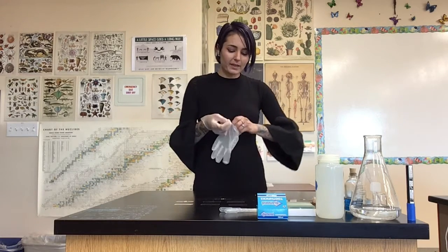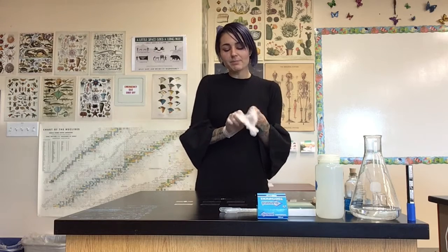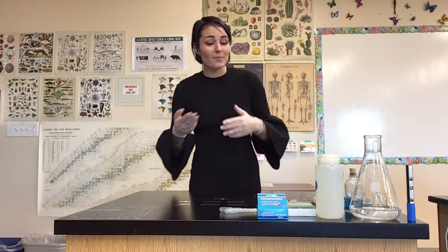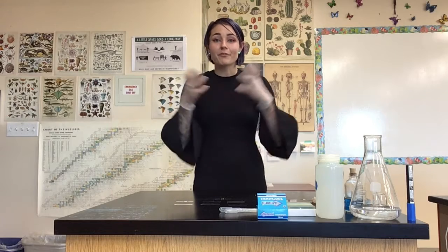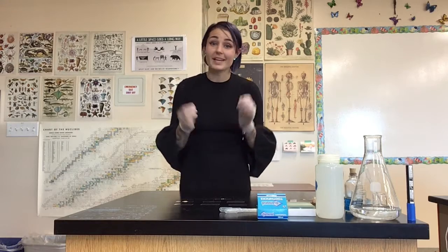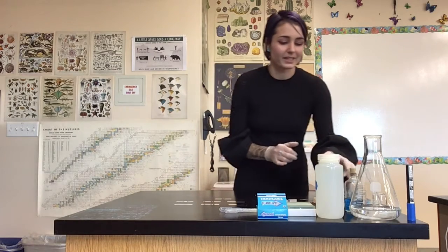And what methylene blue does is it binds to our DNA and RNA, and because we're trying to see if we can find cells undergoing mitosis, remember DNA, when it condenses into the chromosomes, is one of the main things that we're going to be able to see, hopefully, because it's just a bunch of DNA, which means that the methylene blue should stain it, and we should be able to see it nice and clear.